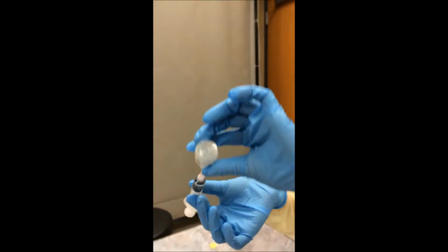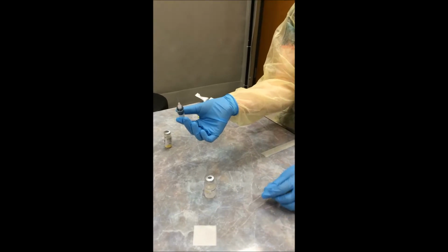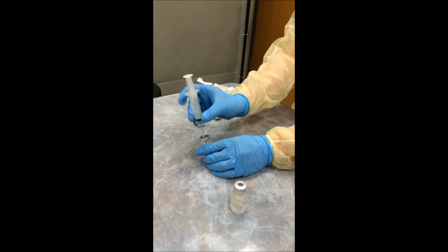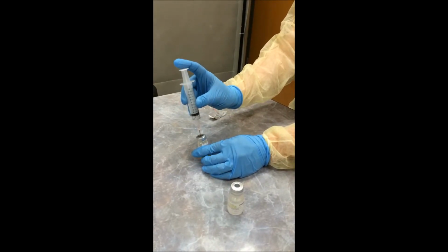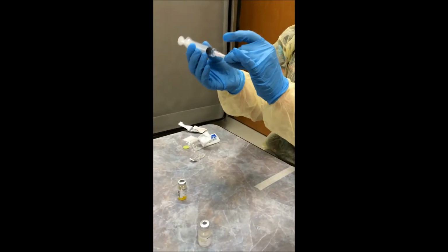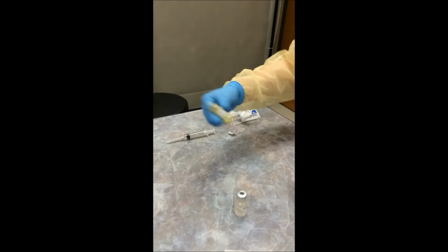You'll take this out, yet again, not blocking first air, making sure you're not going over any of the critical sites. You will take this in order to reconstitute, put it in 45-degree bevel up, and put the liquid in. All right, so now that that's in there, take this, cap it. You can set that aside. This, you're going to need to let it dissolve. As long as you don't cover this, you're okay. You can just shake it up.